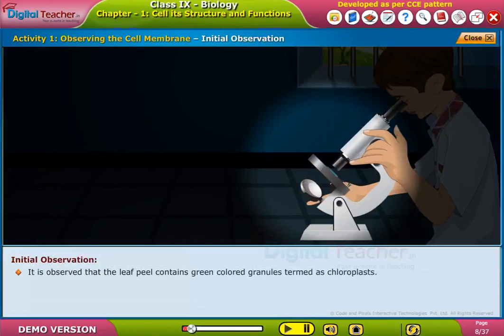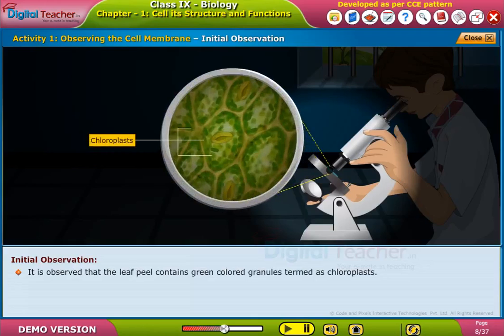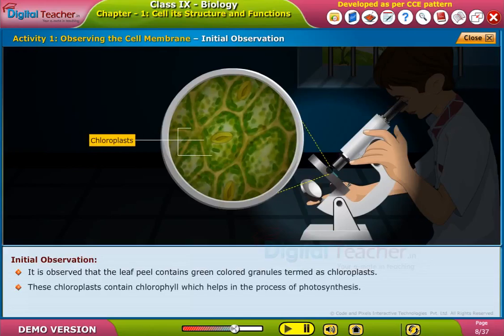Place the permanent slide mount under a microscope and observe the light portion of the leaf. It is observed that the leaf peel contains green-colored granules termed as chloroplasts. These chloroplasts contain chlorophyll, which helps in the process of photosynthesis.